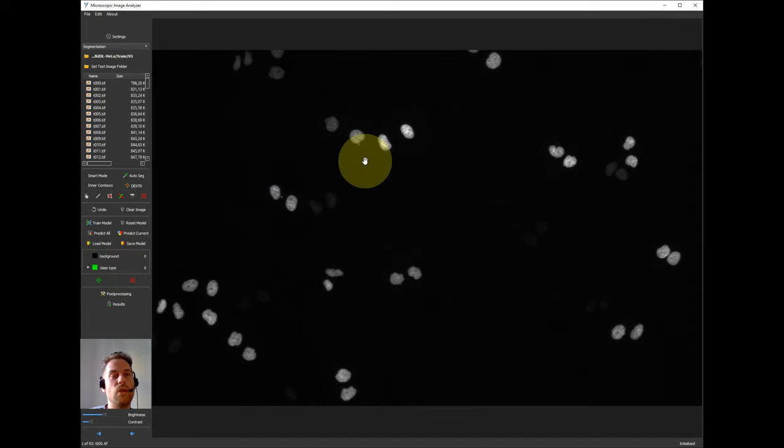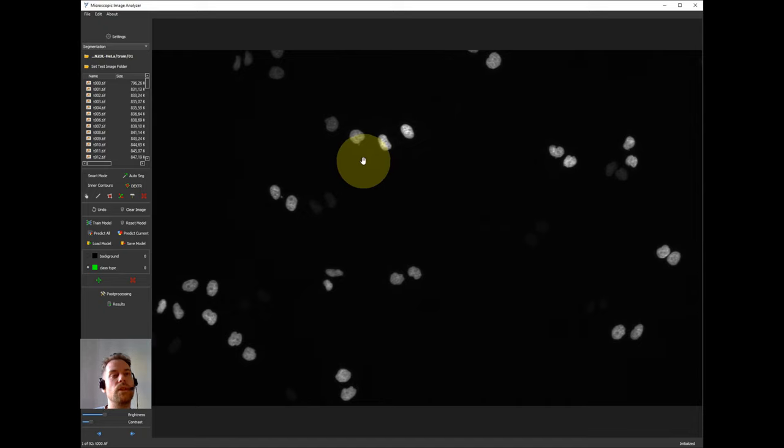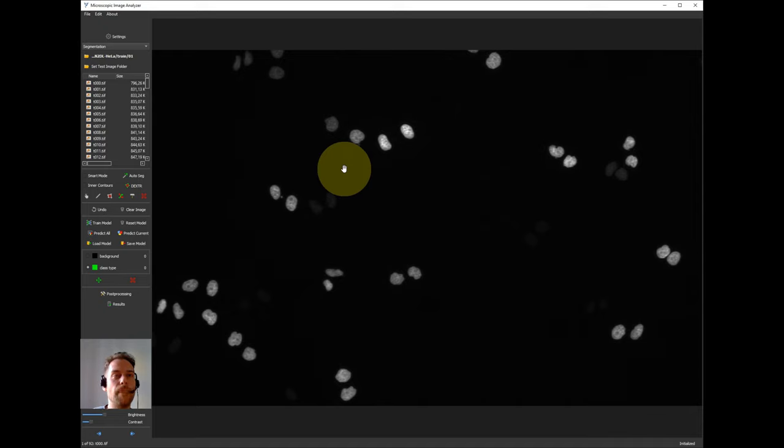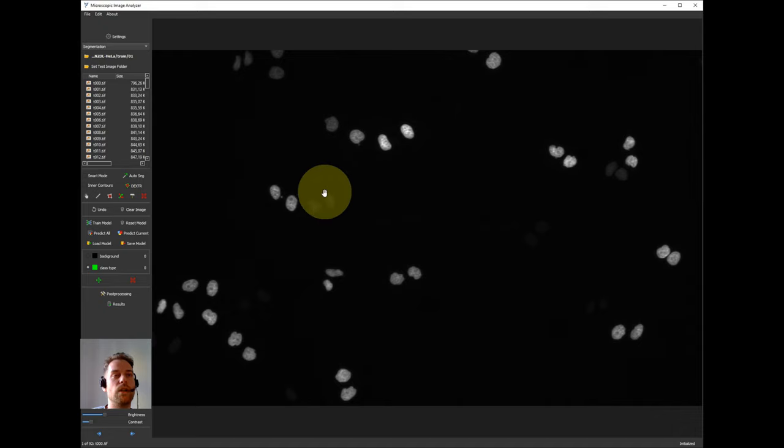So first we would need to define how many classes. The first step is to identify the nuclei. We can do this as a binary classification problem, so we only need two classes which are background or cell. And in the second step we can add a third class to differentiate between regular nuclei or the ones which are in cell division.